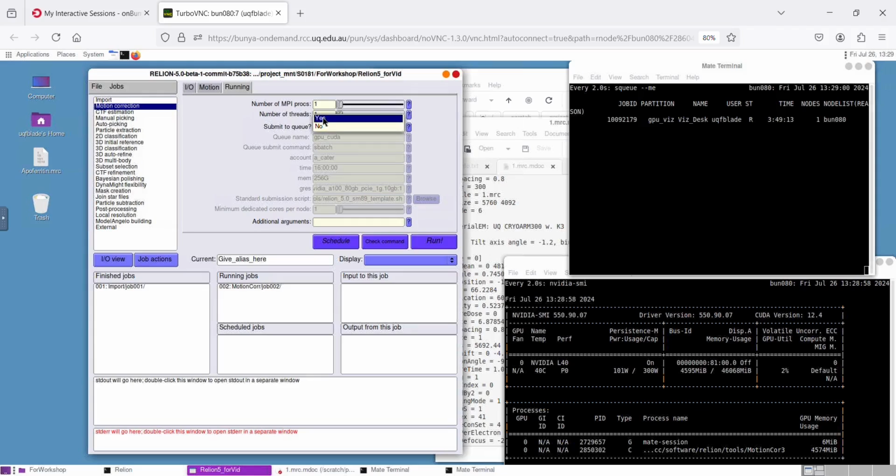So how do we do that? We are going to submit to a queue. Our queue name here is gpu_cuda, or CUDA, and this is what most of the cryo-EM processing has been optimized for. So we also have AMD cards, but again, this processing has been optimized for NVIDIA cards, and to access those, we need to ask for the CUDA part. So this will also be an sbatch command. Again, if you want to learn more about this, head to the GitHub.